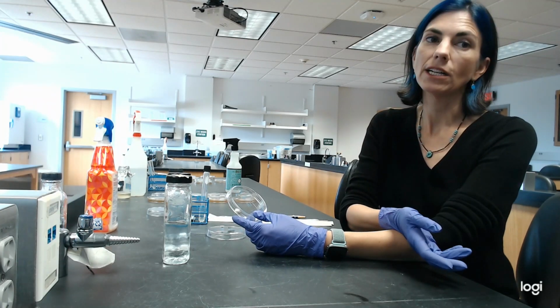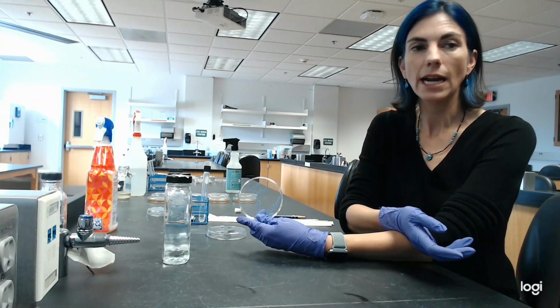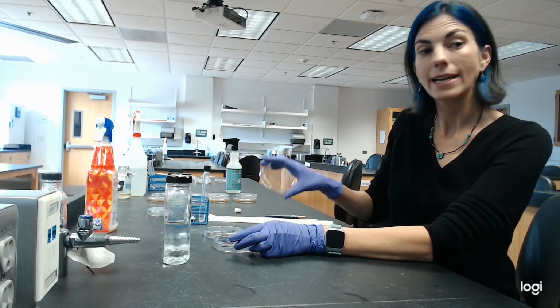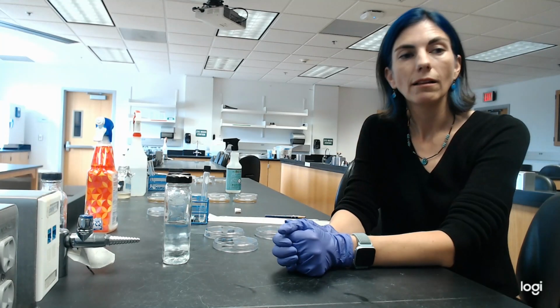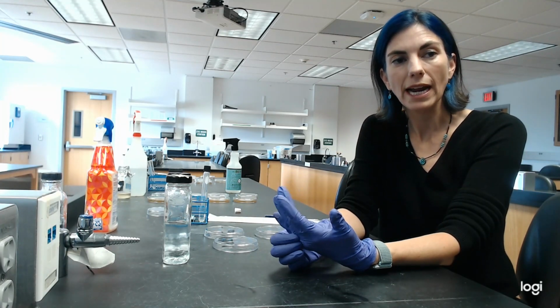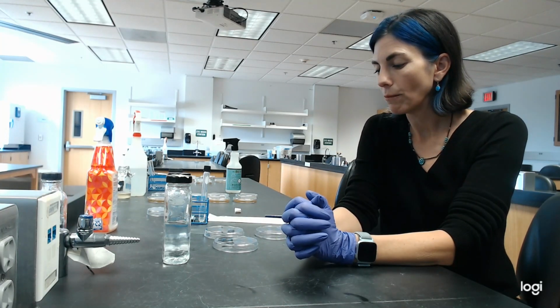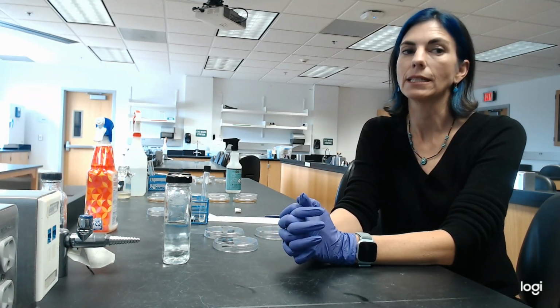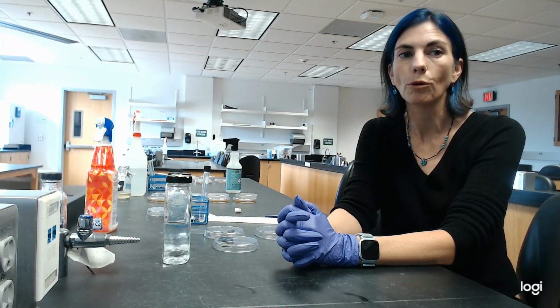So I'm not even going to do that one, to save on resources. Instead, I'm just going to do the 10 to the minus 5, 10 to the minus 6, and 10 to the minus 7. The urine ones, likewise, I'm going to adapt which dilutions I do based on what I expect to see, so that hopefully I can get a countable plate in each set.